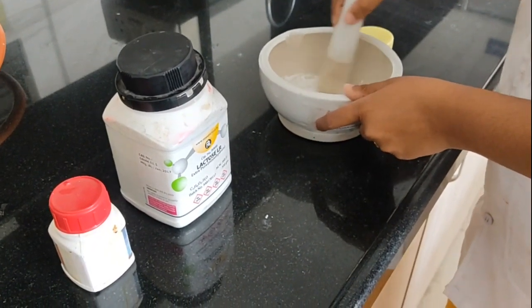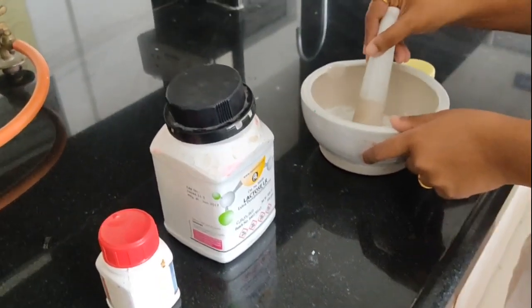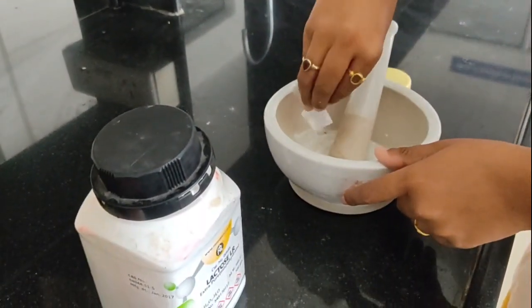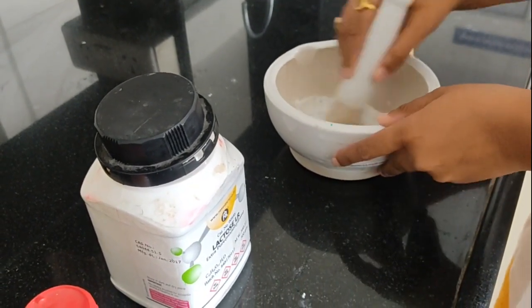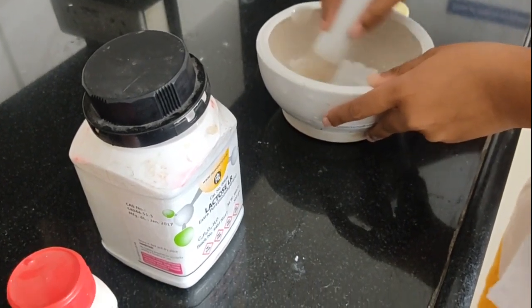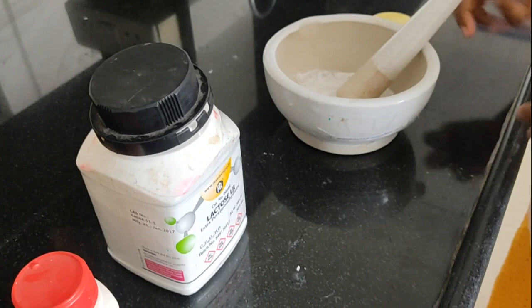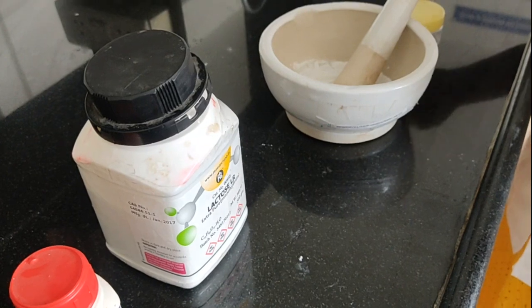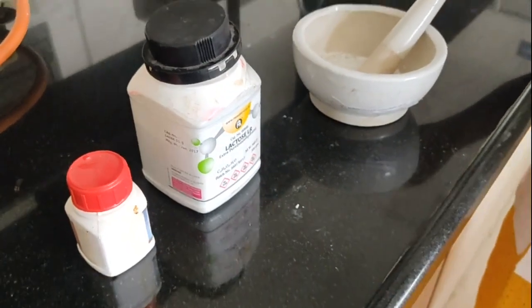Trituration is performed to reduce the particle size and to achieve proper mixing. Again, after trituration, I am going to add the remaining amount of the diluent lactose and again proceed for trituration. After proper mixing of both the powders, now I will transfer this onto the white paper, then wrap each single packet, and after that put them into this container, and then we will proceed to the labeling part.